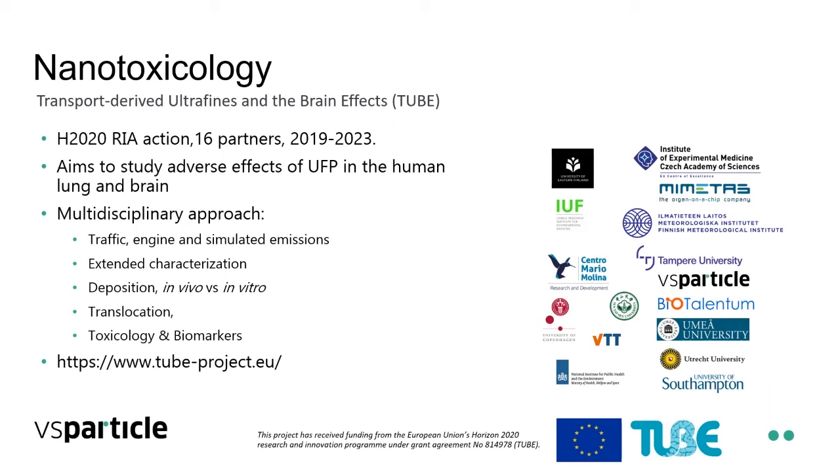People are looking at how to deposit these things to some extent in vivo, but mainly trying to get everything done in vitro, because even though you might sometimes need to study in people and animals, it's of course much preferred if you could just do that in a device. And of course, where the particles end up, so translocation. And finally, also including the toxicology and if there's any biomarkers occurring, which we could use to figure out what's going on in there. I'll happily keep you updated more about this at a future date when more information comes out.